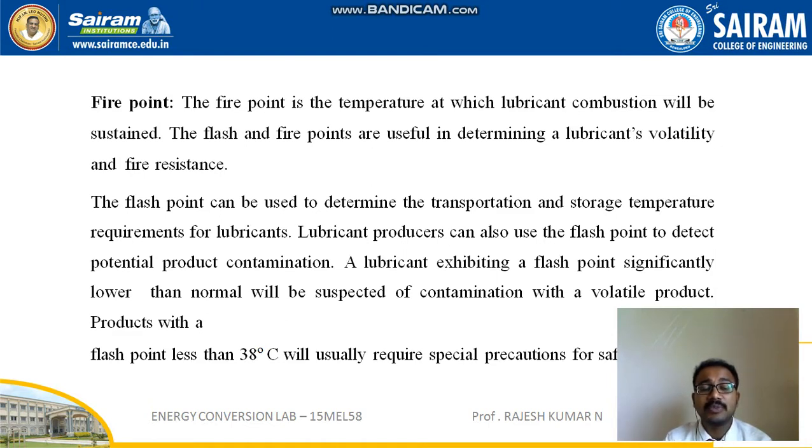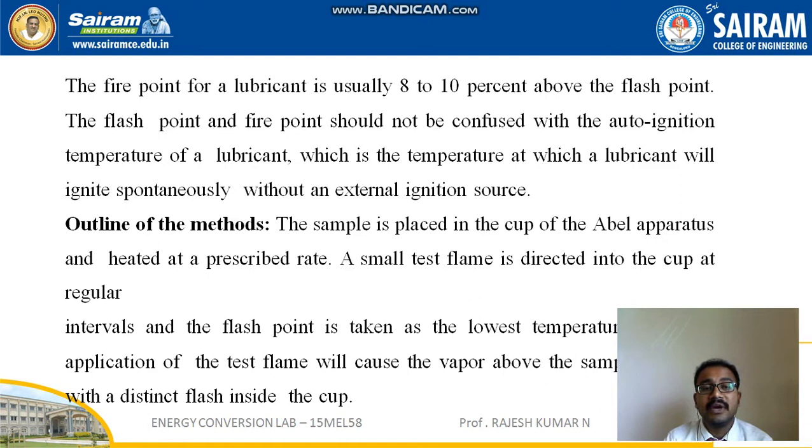A product with a flash point less than 38 degrees Celsius will usually require special precautions for safe handling. The fire point for a lubricant is usually 8 to 10% above the flash point. The flash point and fire point should not be confused with the auto ignition temperature of a lubricant, which is the temperature at which a lubricant will ignite spontaneously without an external ignition source.